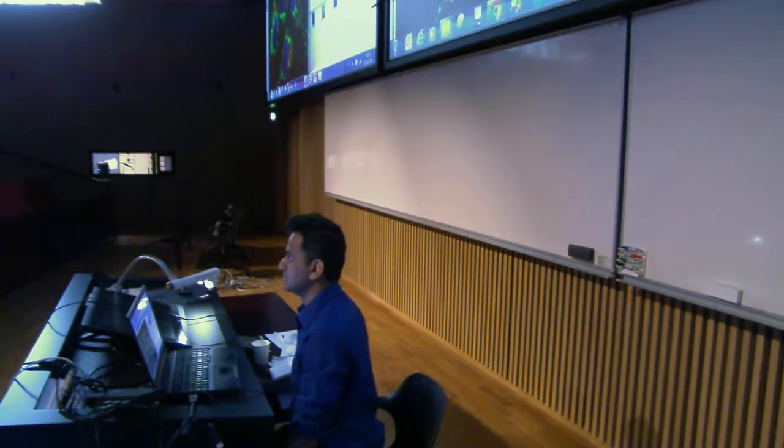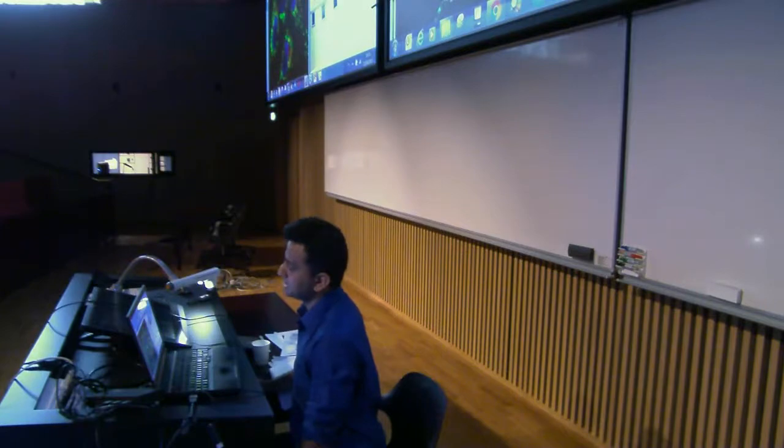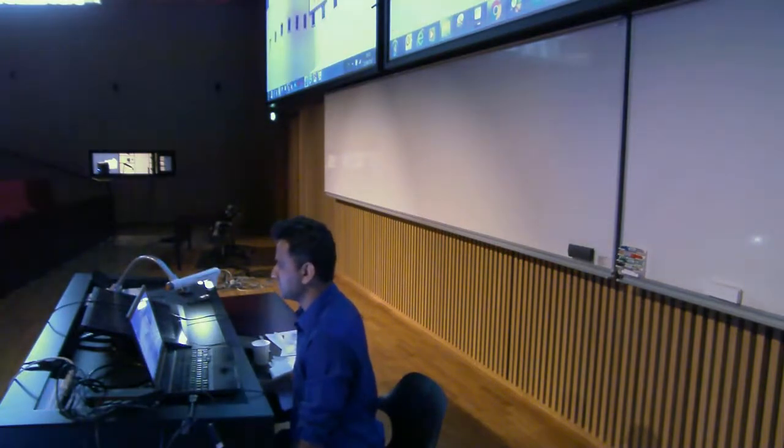Okay. I think it never changes, but I may be wrong. No. So that is allowed for the segmentation. So for segmentation, I'm making an ROI, and then when you say measure, that's fine, because you haven't hit the apply button. Okay, let's actually check this hypothesis. That's a very good question.